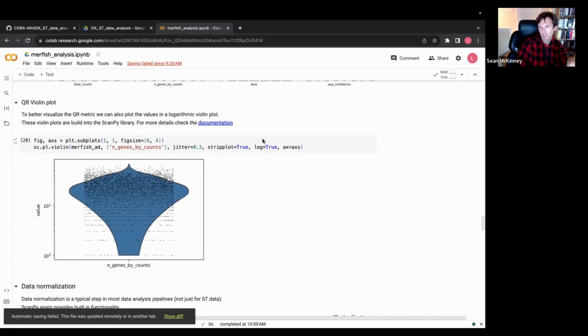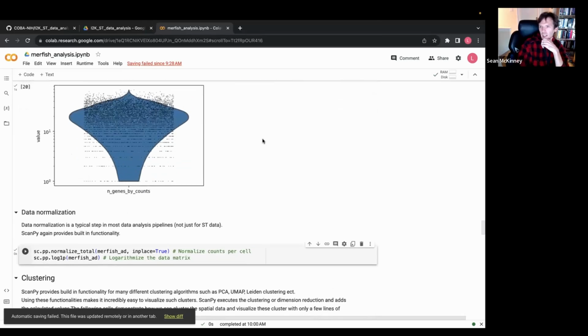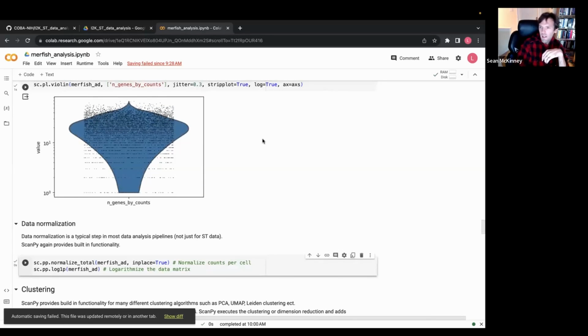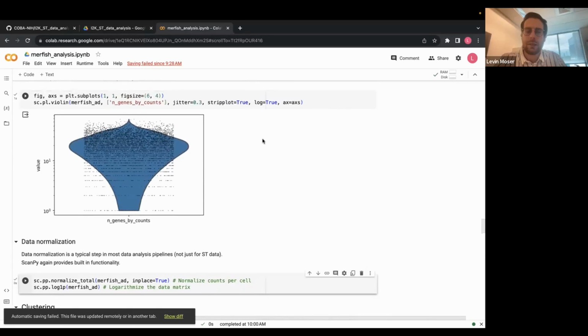So you've now lost your raw counts. I didn't know if there was something I didn't know about where it was keeping a shadow copy of that somewhere. Yeah, I don't know. That's a good point. I'll have to look into that. But thanks for that.